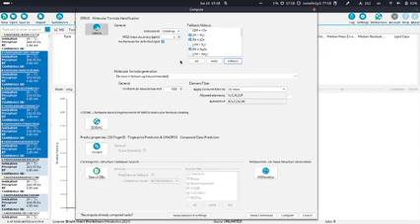So basically, when you pre-process your data in a different software, MZmine, and then export to SIRIUS in the MGF format, there will not be the option anymore to distinguish, because you lose MS1 information. Yeah, right, but you have then the adduct detection in MZmine and should annotate them in the MGF file. So it's basically the same. The fallback adducts here are basically what should happen if there's no adduct annotation, which is still the case for most of the compounds.